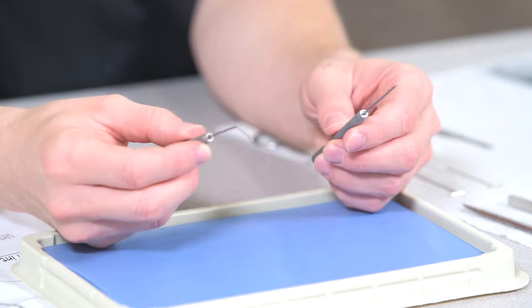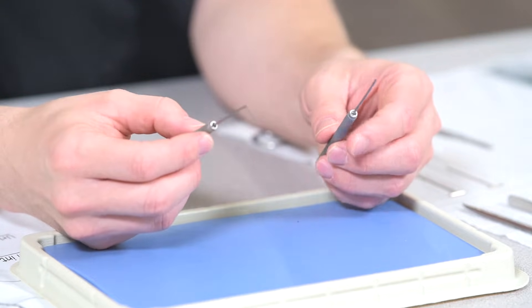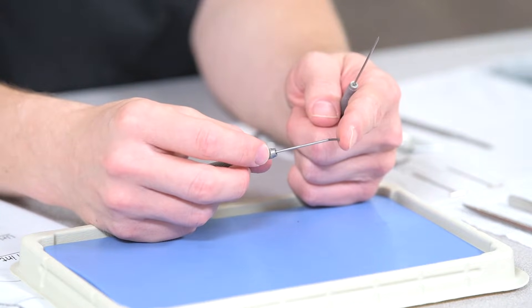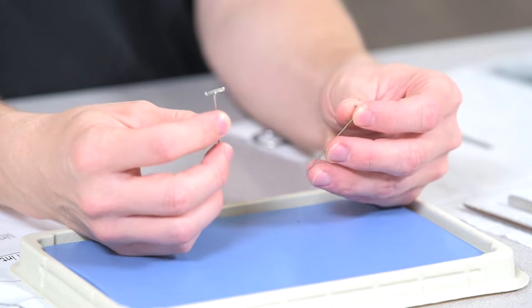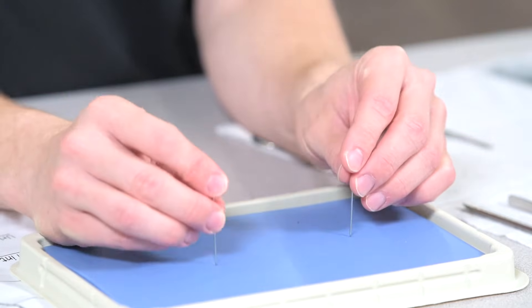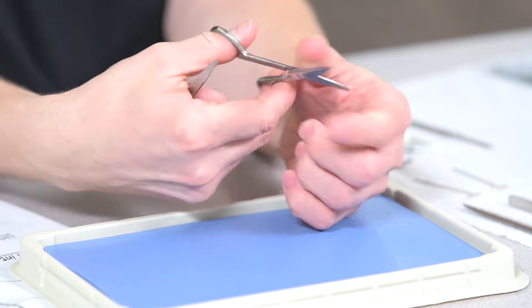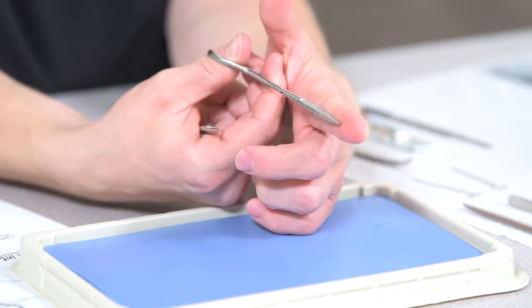Teasing needles — I have a straight tip or a curved bent one — are what they sound like. They are meant to simply tease tissue; you don't need to use much force. T-pins assist with holding down the specimen, muscle, and skin flaps. Scissors assist with cutting the outside skin, tough tissue, and sometimes bone.